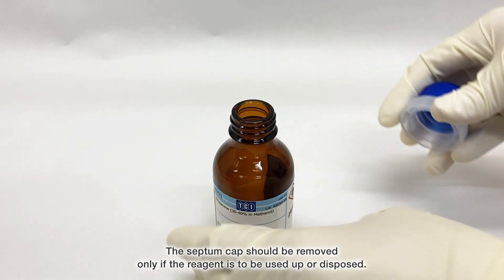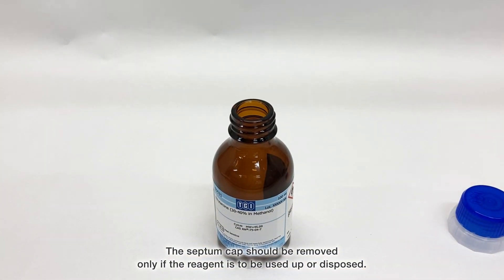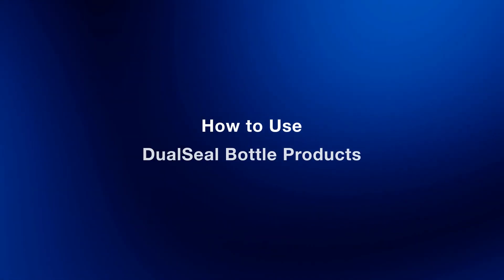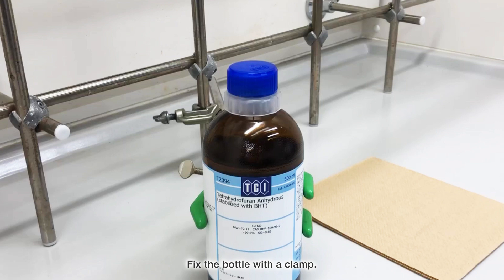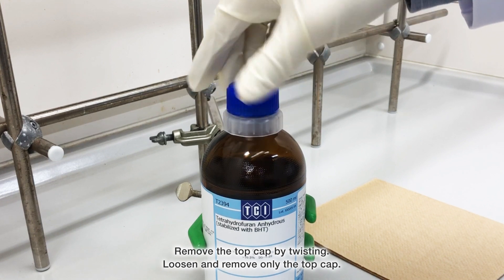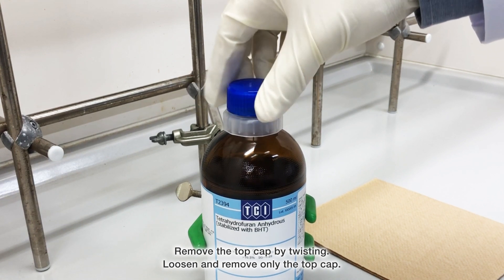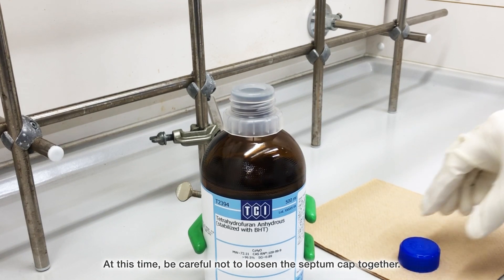The septum cap should be removed only if the reagent is to be used up or disposed. Fix the bottle with a clamp, then remove the top cap by twisting. Loosen and remove only the top cap. Be careful not to loosen the septum cap at the same time.